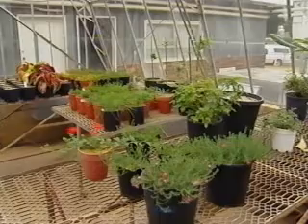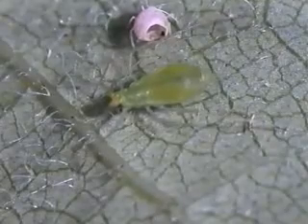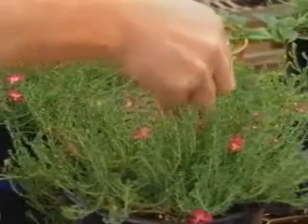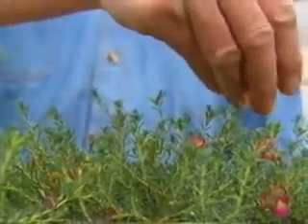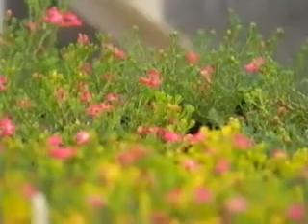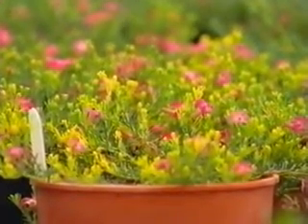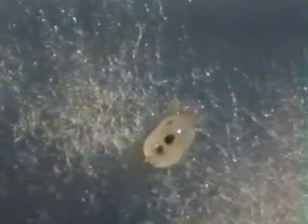Not only does growing plants in a glasshouse reduce the population of microorganisms living on the surface of the plant, it also helps to produce quality plants for stage 1 due to regular fertilization, use of fungicide and insecticide. So, at the preparatory stage, we need to ensure that the stock plant is growing vigorously and is free from pests and diseases, especially the microscopic pests such as mites and thrips.